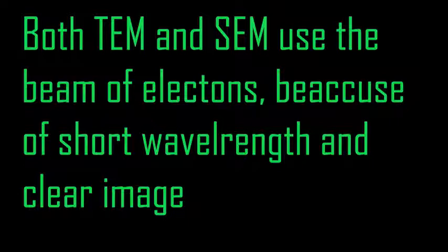But the transmission electron microscope produces a two-dimensional image, while the scanning electron microscope produces a three-dimensional image.